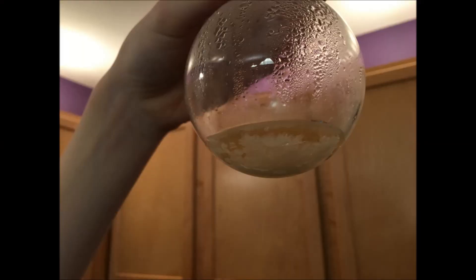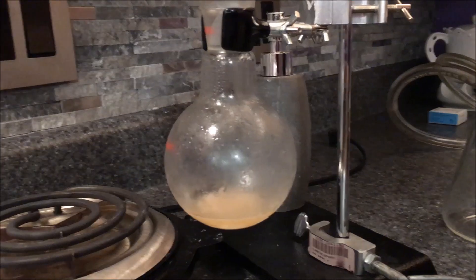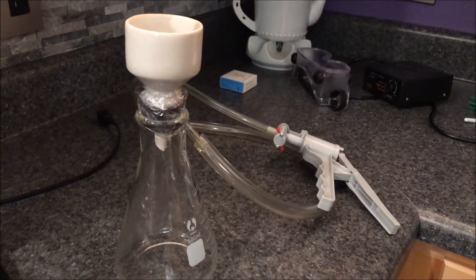After it cooled, I got a nice amount of crystals, but I decided to place it into the freezer for a few minutes to see if I could get any more. Then set up for vacuum filtration.